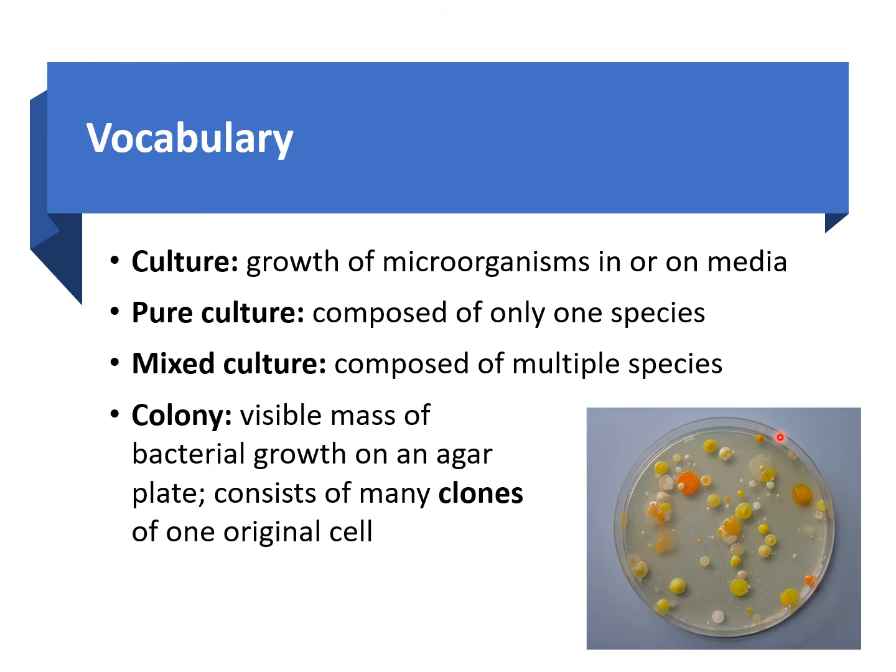So even the margins of the colonies on this plate, you can spot some differences. And then even the colonies themselves, you can see some of them might be raised, and some of them might look pretty flat on the plate.